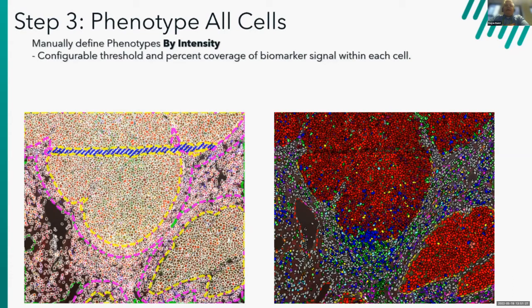The first pass is we're going to identify the different phenotypes based on the presence or absence of signals. Again, I don't care how those signals are generated because this is an image at this point, a digital image. We just know that each signal has a high, medium, and low intensity range. You could have more degrees of that. But essentially, I'm going to set a level of positivity by an intensity threshold.